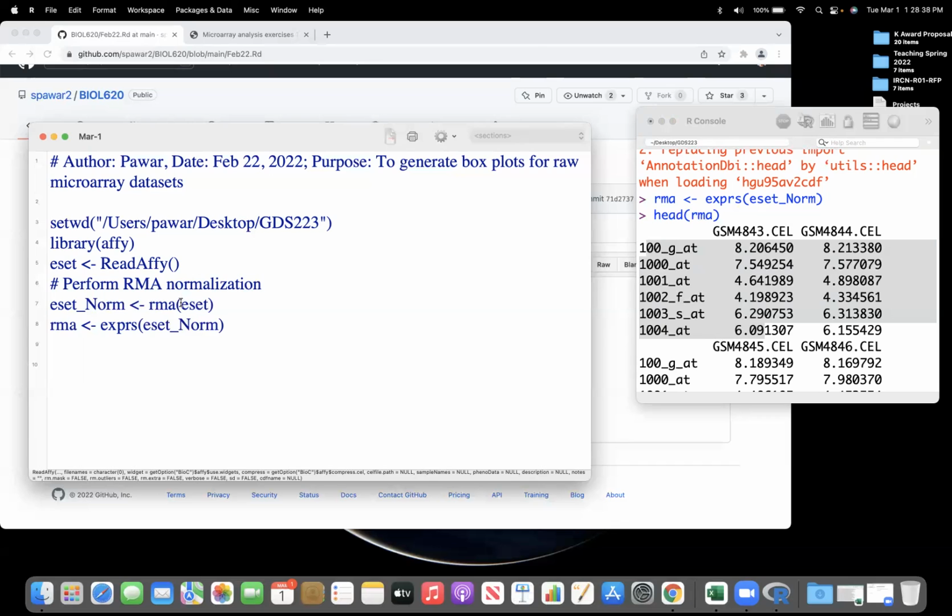Rerun it again. Error in validating argument: object is set, selecting a method for function, not found. Did you run line number 4?